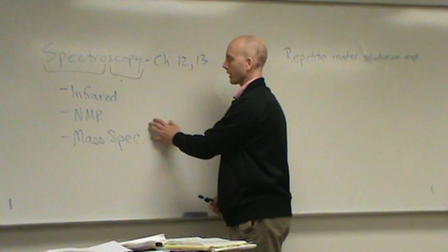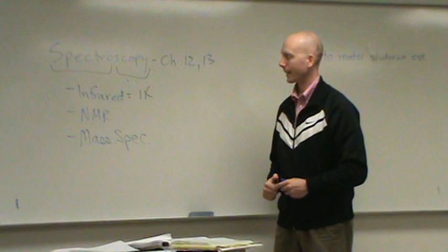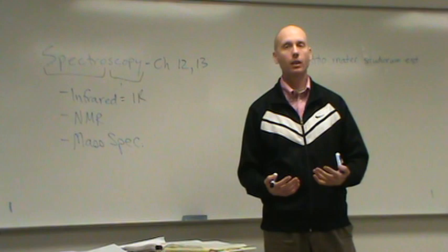Infrared, that's oftentimes called IR spectroscopy. NMR stands for nuclear magnetic resonance spectroscopy. That's a big one. We'll get to that later. And then also mass spectroscopy. Okay? So these are the three major ways we're going to look at molecules to get an idea of what we're looking at.